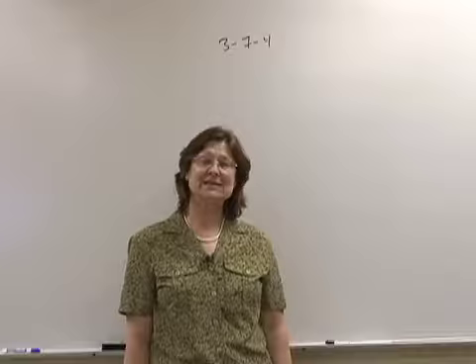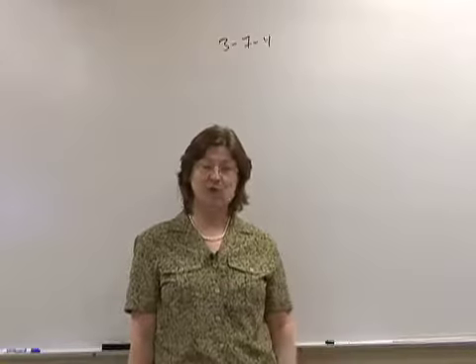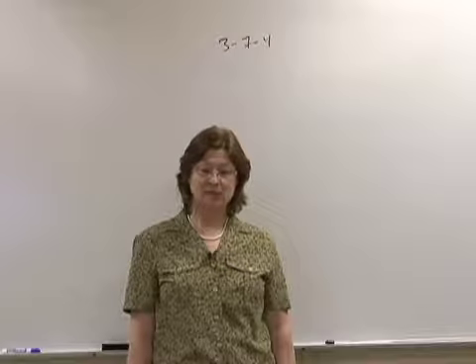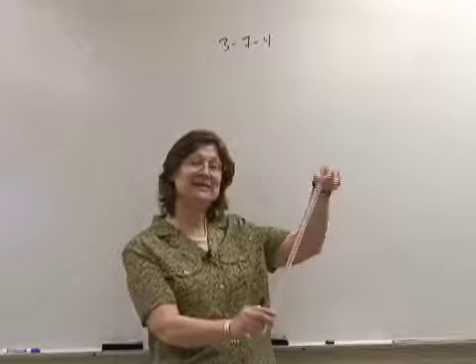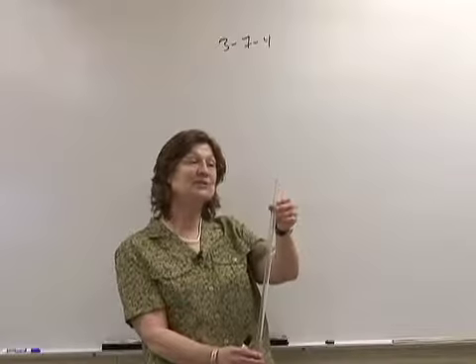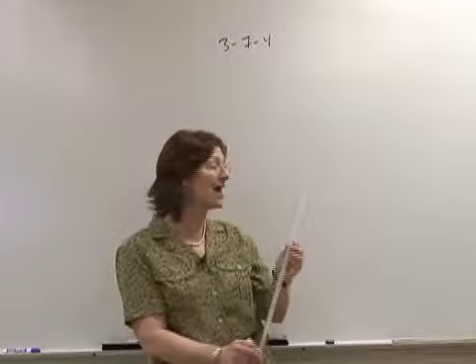Number 2 is asking for what values we are going to record in the lab today. And what is a eudiometer? Well, a eudiometer is a gas collecting tube, and this is what we'll be using in the lab, and we'll see it a little bit closer when we get to the lab.